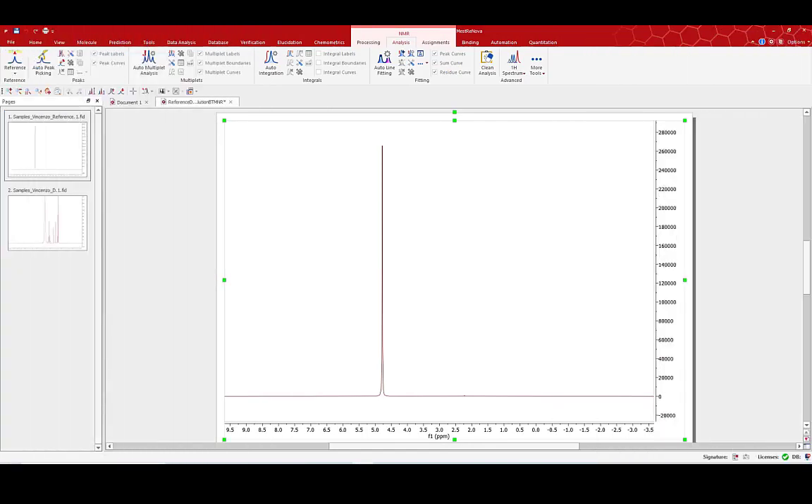It's an often overlooked fact that the line shape of a spectrum collected on a benchtop NMR system is dominated by the magnet and shims, and not by the sample. The implication is that line shape improvements or resolution enhancements can be achieved using reference deconvolution, where the reference spectrum has been acquired separately from the sample.